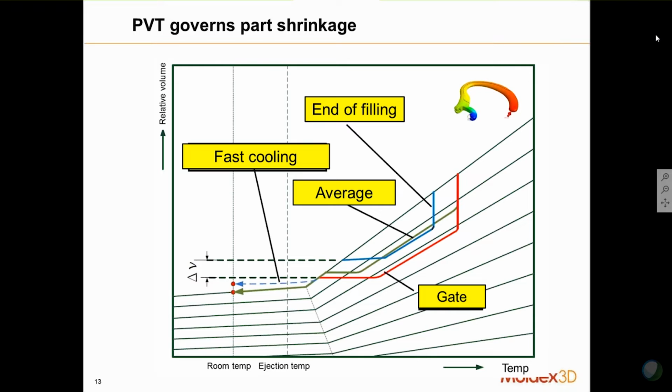This is very easy to understand, because when we increase the temperatures, we give the system more energy. So the system can move freely, and in that case, the density will become lower and the specific volume will become higher. However, when we apply pressure, it's a different phenomenon. If we apply higher pressure, this will take out the free volume in the space. So in that case, the specific volume is going to decrease, and the density is going to become higher.